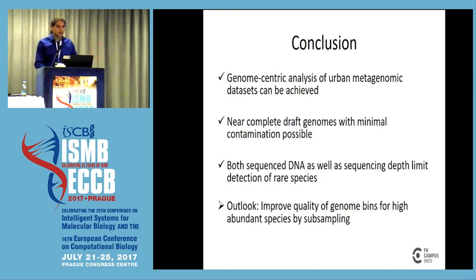I had some from the pooled samples; in the single samples they were usually not that detectable, but from the pooled ones I had some with 80% estimated completeness, so that is already quite neat in this regard, and less than 20% contamination. But I have to say I cannot honestly answer yet, as the analysis was not done thoroughly enough.